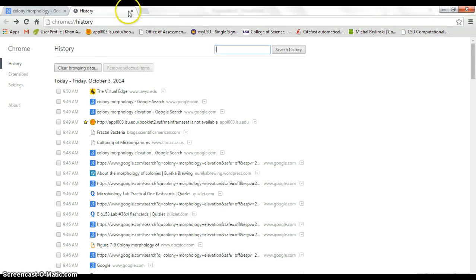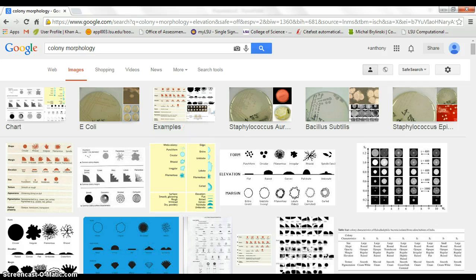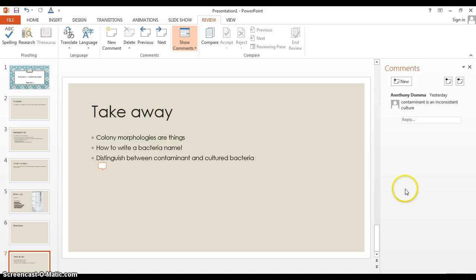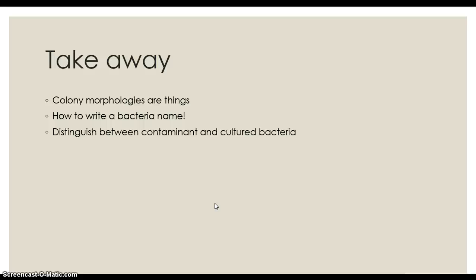sorry, I encourage you to try to find examples of each one and become familiar with each colony morphology, and then how to write the bacteria name is very important and then distinguish, and then what this allows you to do is that when you have a consistent colony morphology, and you have something that varies from that consistency, then you can identify that as a contaminant and recognize that that's not what you want. You want the consistency in the colony morphology. So, that's the importance of colony, colony morphology. And so, try to look up examples and become familiar with all those because this is an important skill because I think you'll have to do it on your practical.